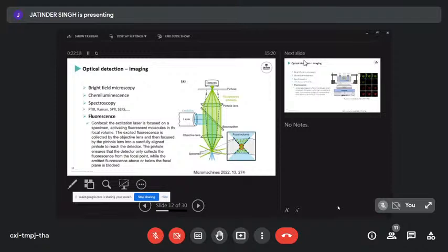The nice thing about confocal microscopy is that you actually do get the Z resolution, and you can scan in the Z direction. Then the images you get out of your confocal microscopy system are three-dimensional, which is really cool if you want to look at how proteins are distributed around a cell.